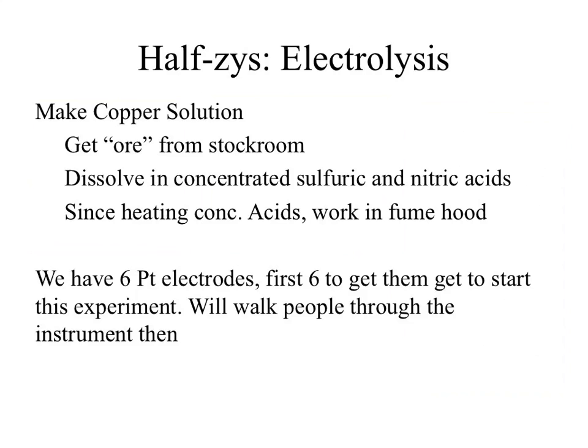Okay? Problem with that is that these metals end up being very, very highly valued. So a single platinum electrode that you guys are going to be using is worth upwards of $2 or $3 grand. Okay? Which means we don't have a lot of them, which means to get them, you have to give the stockroom some collateral. Okay? Usually they're okay with just an ID. Sometimes it's an ID and a key to your car. Okay? So that there's no way you can leave without it. Okay? So just be aware of that.